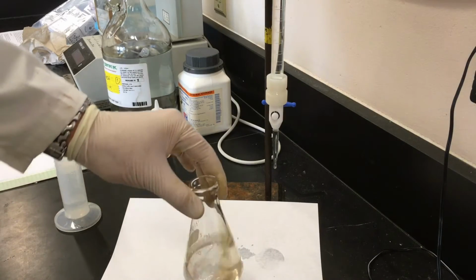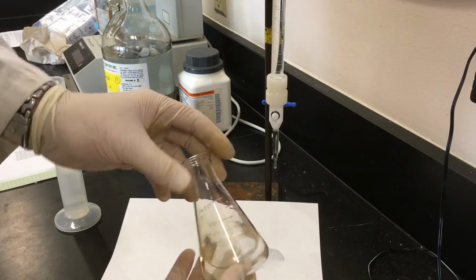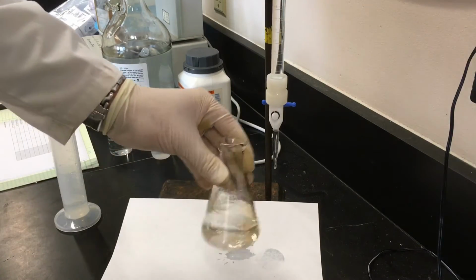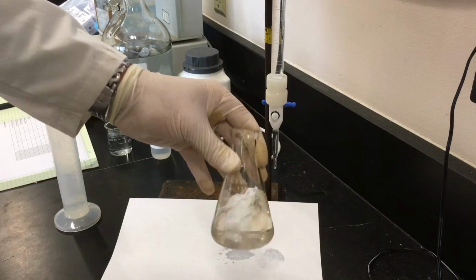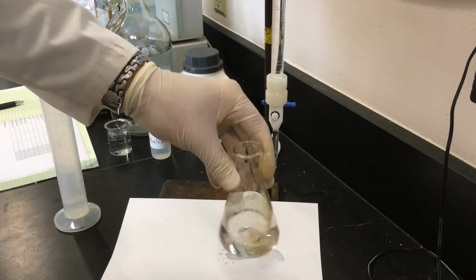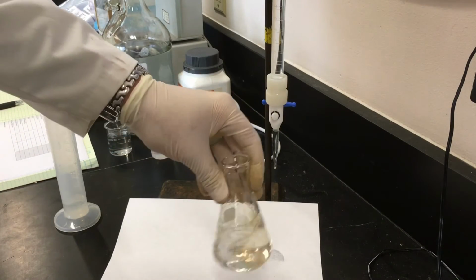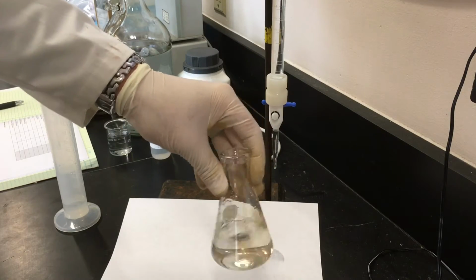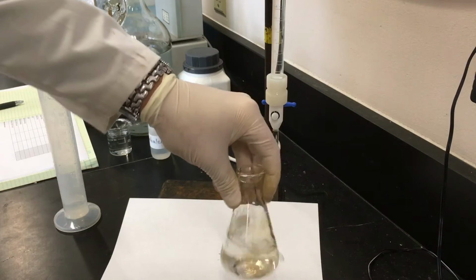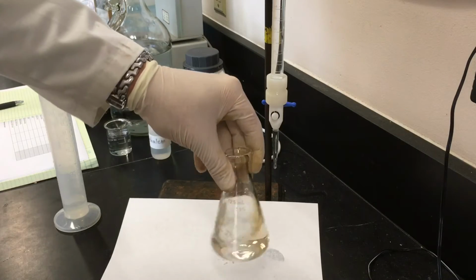And the amount of water that we add doesn't really matter, because adding water doesn't really change the amount of acid that we have in the Erlenmeyer, right? So when we're titrating and we get to the equivalence point, we're going to get the moles of acid, which will be equal to the moles of base. And so therefore, adding a little bit more or a little bit less water doesn't change anything.